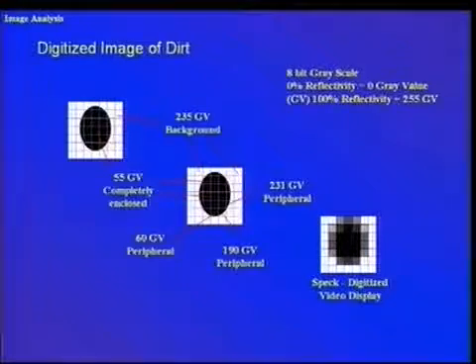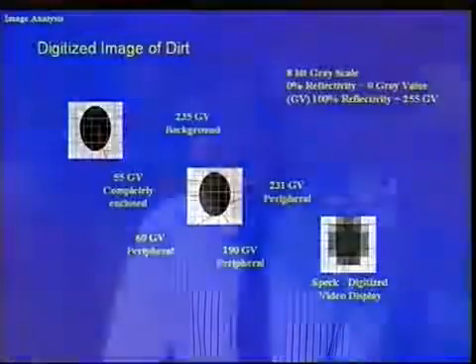As you go up in resolution, the edge effect becomes less and less of a factor in the image and improves the accuracy greatly, primarily because there are more subtended pixels than there are on the edge. So the weighting factor is very important, and it really is the resolution.